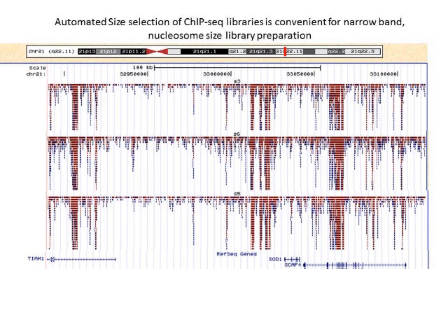The conclusion from this is basically that for a narrow size range, you know it's going to be at 180, but you can't really see it. The Pippin Prep is really useful because you can just give it a broad swath around the peak region that you're expecting, and then you can go and drink some coffee, and the machine will take care of the rest.